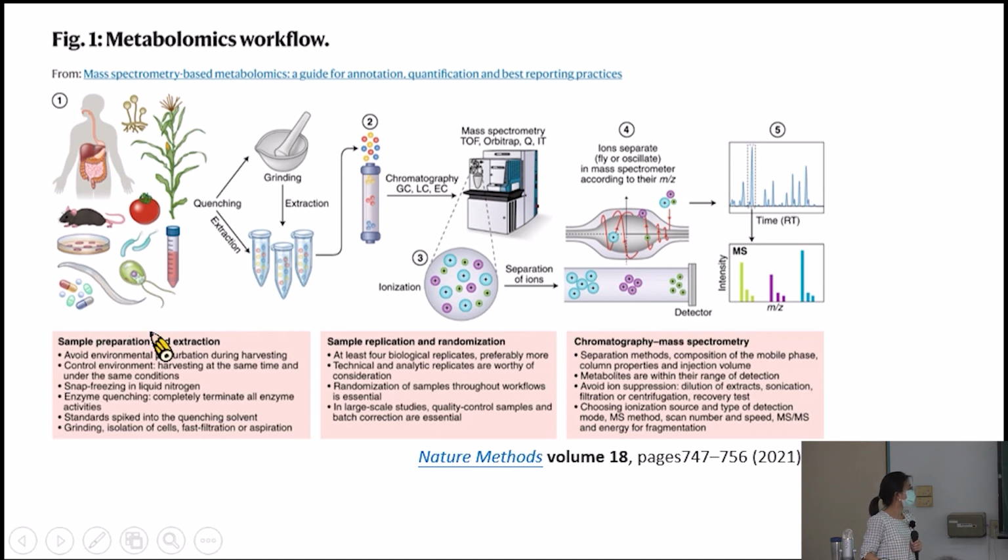For example, you probably need to follow the author's suggestions, including avoiding environmental perturbations. In other words, if you want more reproducible data, you need to harvest your samples under the same conditions as much as you can.